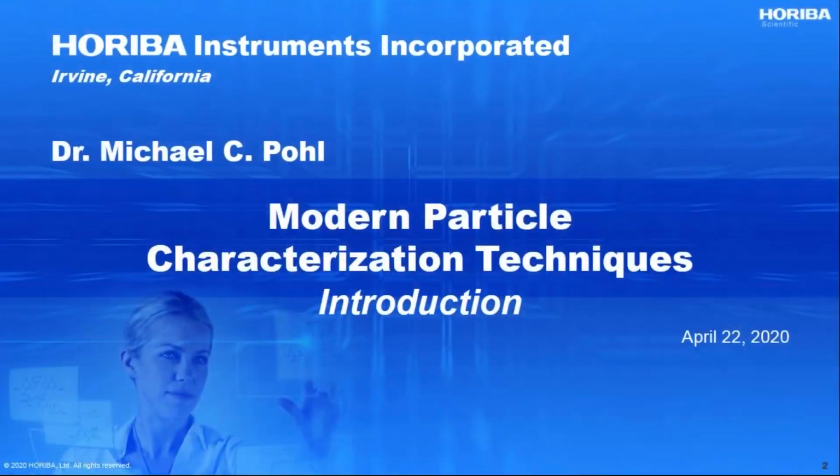Well, what we'd like to do today, as Julie has introduced, is not talk about any of the specific techniques she mentioned earlier. What we're going to look at is how we use this data, how we generate good data, and how we analyze what is happening with our particles. We'll use that as the framework for today, and hopefully take you through some topics of interest to get you ready to go with particle sizing. So here we go. This is going to be our topic for the day.